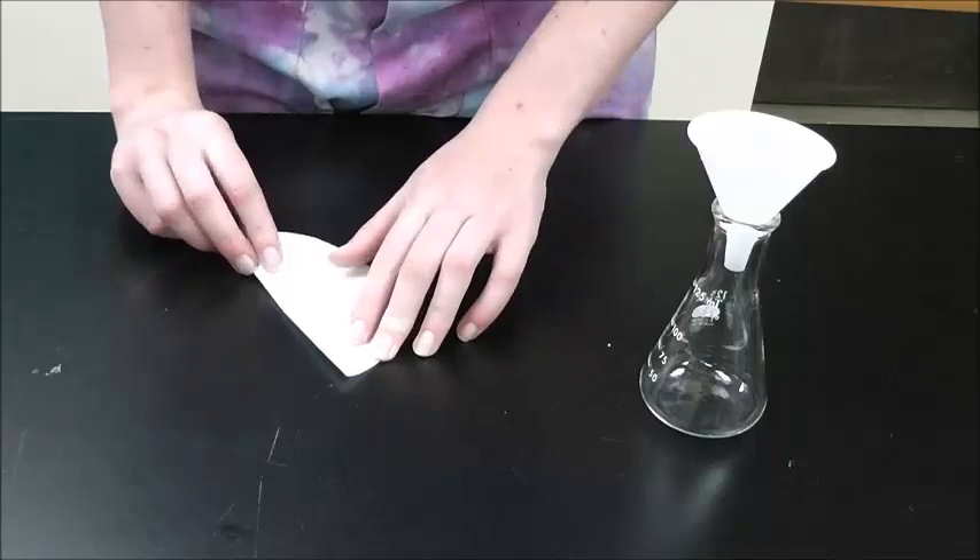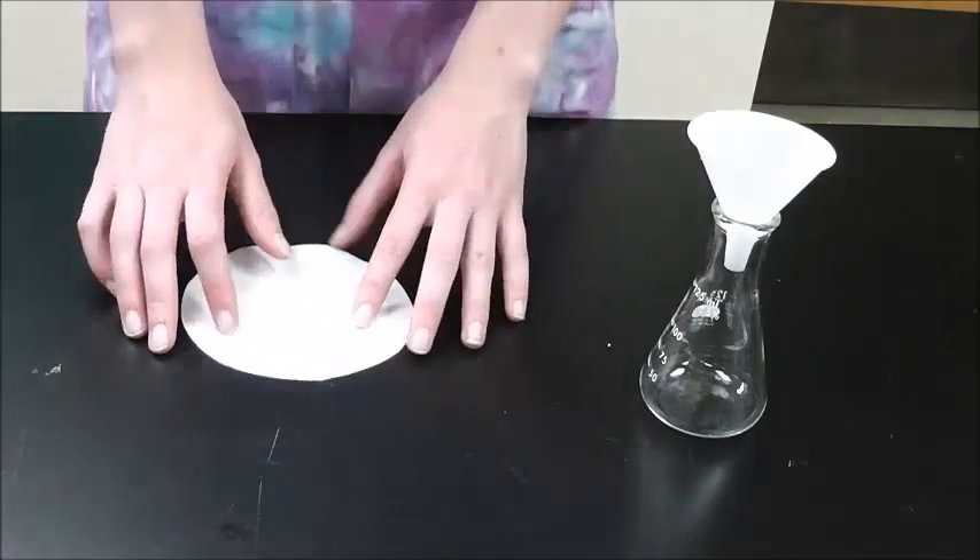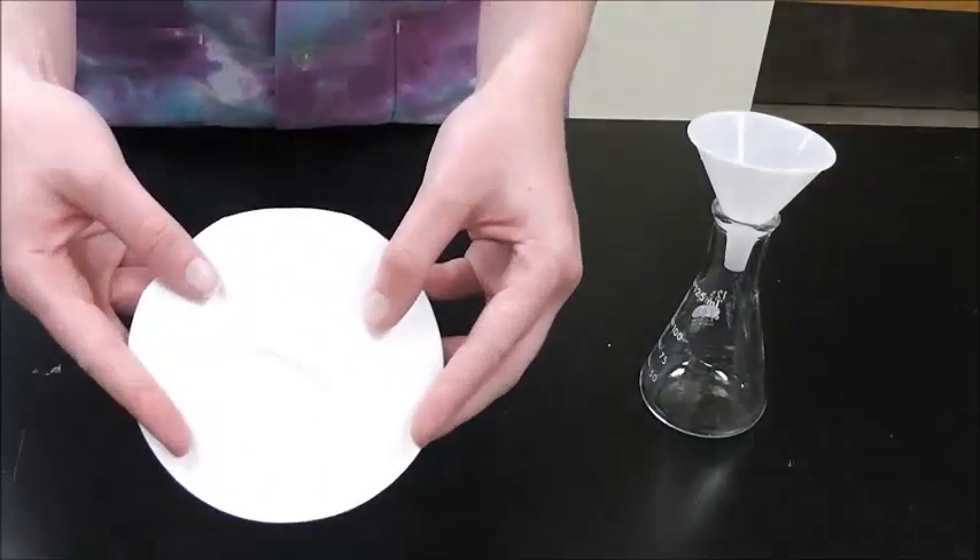When you are done, your filter paper should be divided into sixteenths, with alternate increases up and down, as seen here.